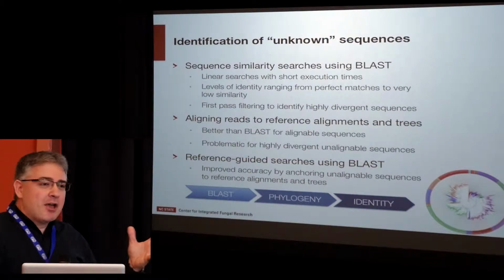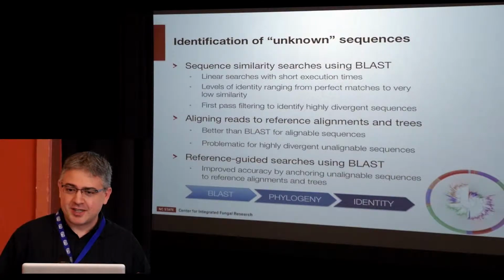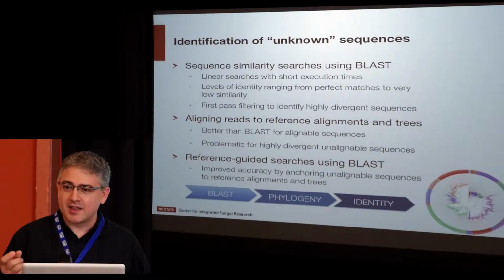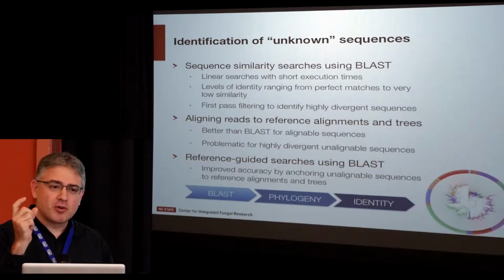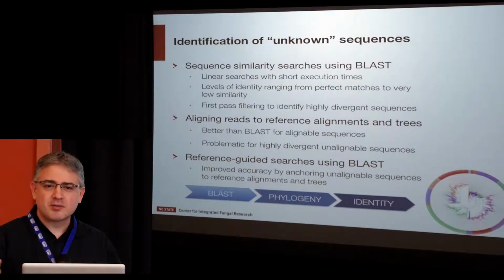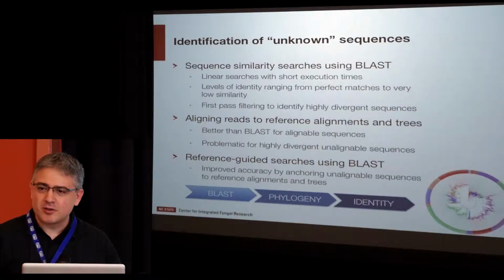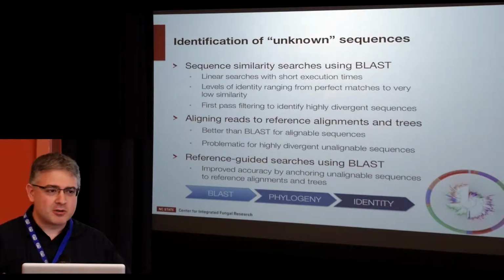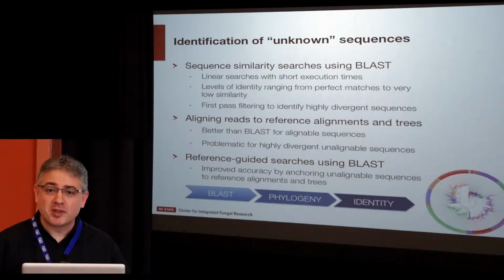So, how do we do this? There's no tool out there that will actually allow us to zoom into a phylogeny and then say, I want to now examine all the sequences in this clade. So I want to do a local alignment, or I want to do a local analysis. They're all global. Most of you have used tree viewing software, FigTree, PhyloWidget, Archaeopteryx, but these tools don't allow you to actually store information, voucher data, or alignments right along with the tree. So there is nothing. I would love to build on an existing tool, but there's nothing out there.